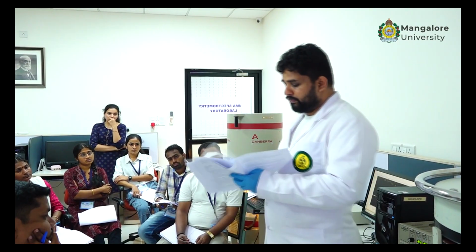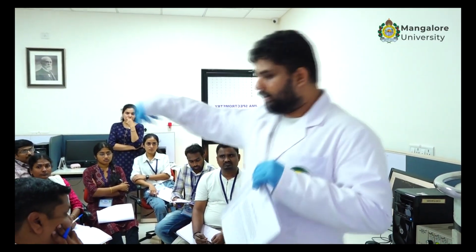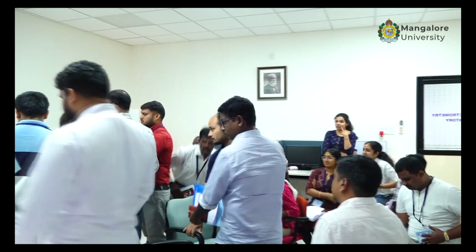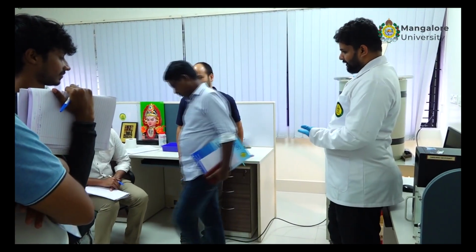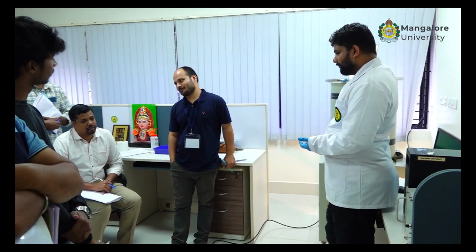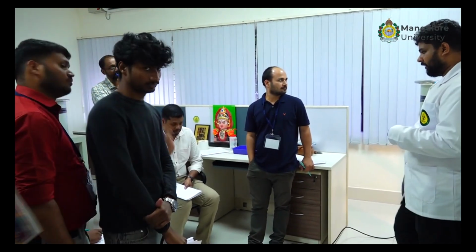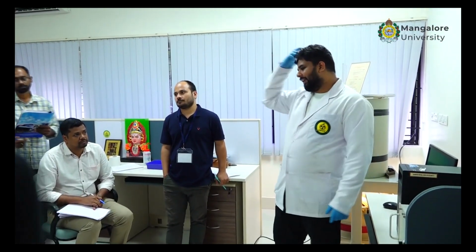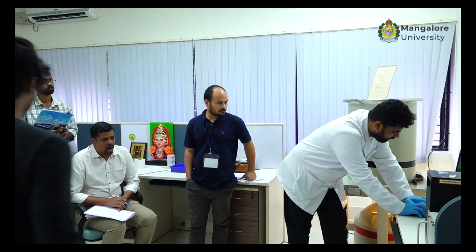Yeah, so if this is clear, shall we analyze a sample? Okay, so you can all turn around to this detector over here. It will take 2 days. 1 day for QC correction, 1 day for sample counting. We already have a spectrum, we will show you that. You can calculate, because this takes quite a long time for the spectrum to develop. We have kept a sample over there. It has not even developed properly, so it will take time.